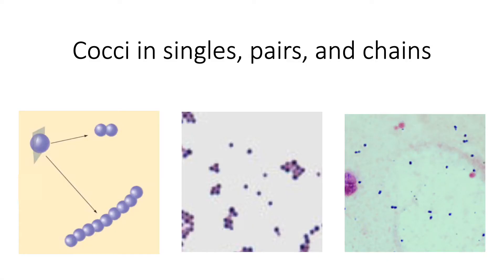Let's take a closer look at the arrangement of our cocci. Here we have cocci in singles, pairs, and chains. Singles are simply individual cocci that you will be able to see under the microscope. Your pairs are two cells or two cocci that are very close together. Here is an example of a single cocci — that's the middle figure here.